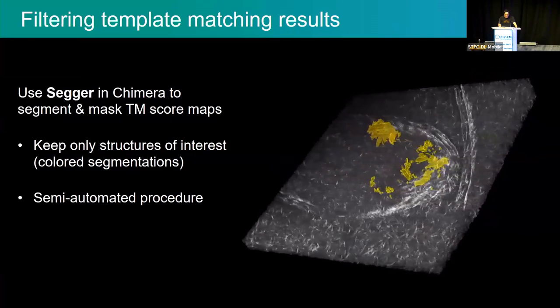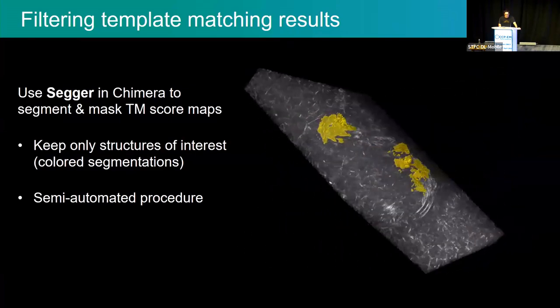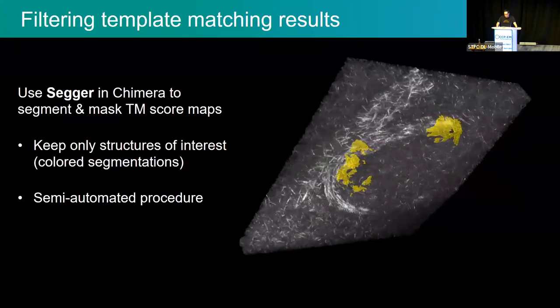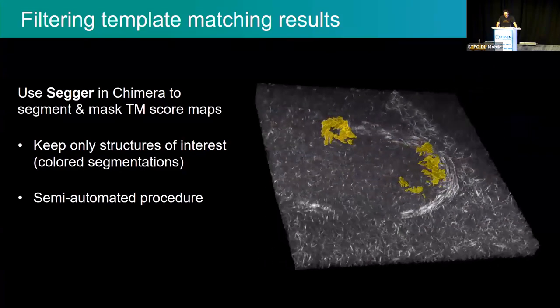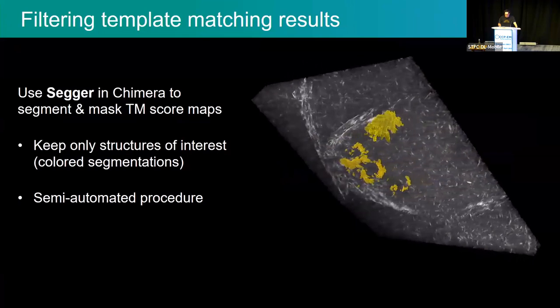And this is almost entirely automated. So if you have a difficult template matching case for filaments, this is something that might help. And I would also be interested in trying the GRACE graph picking based tool that Bia presented yesterday.